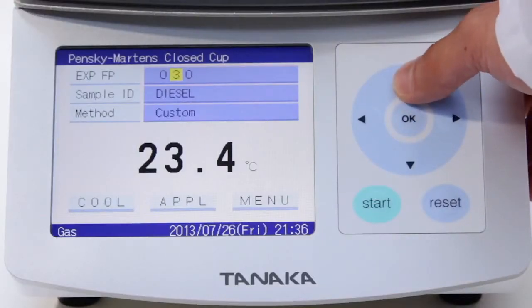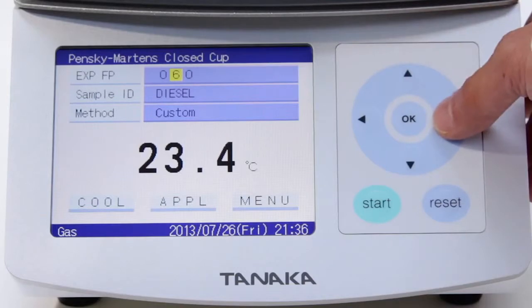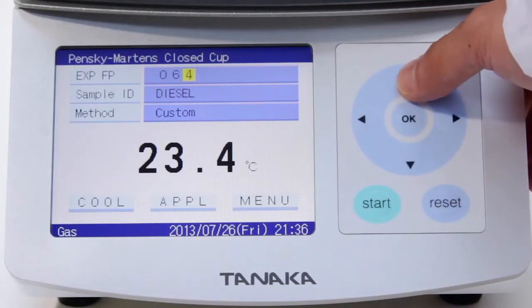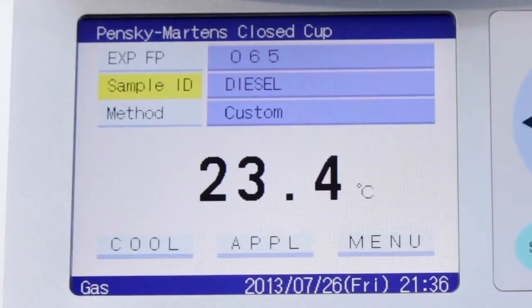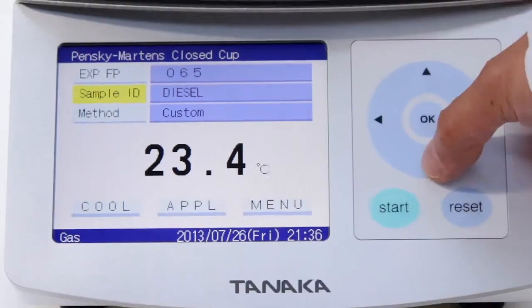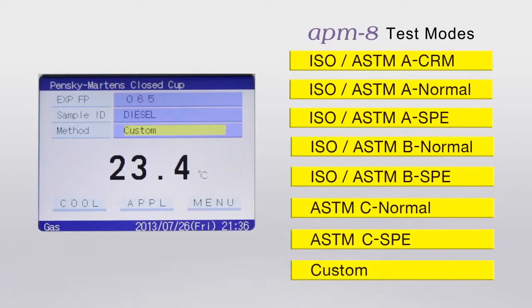There are only 3 steps to perform before starting a test. Enter the expected flashpoint. Enter a sample ID. Then select one of the 8 test modes. The CRM mode, for example, is suited for reference materials, normal modes for ordinary samples and SPE modes for unknown samples.